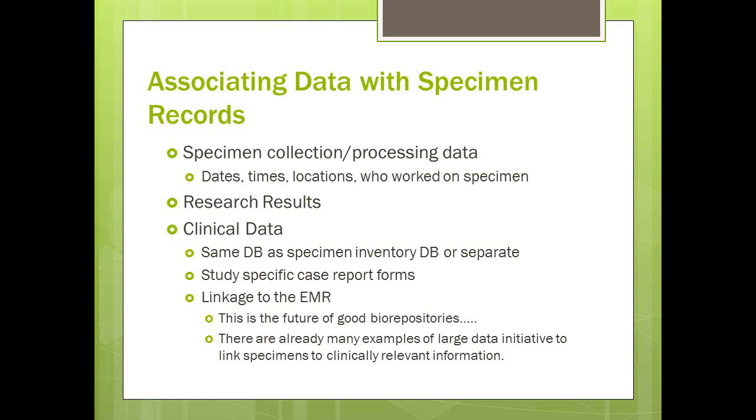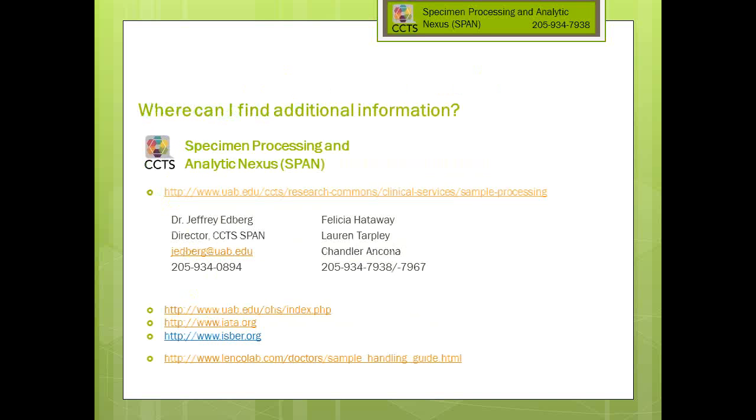Sometimes, if it's using Encore, those can be in Encore. Encore can have case report forms, and you can have your data directly recorded in Encore that would then be directly linked to the specimen, or it could be in an outside database like REDCap or something else. Again, we use a linkage that could be the medical record number or the study ID, which allows you to link the information in different databases. Just think about how you're keeping your information and what those linkages are so you maintain the best use of your samples.